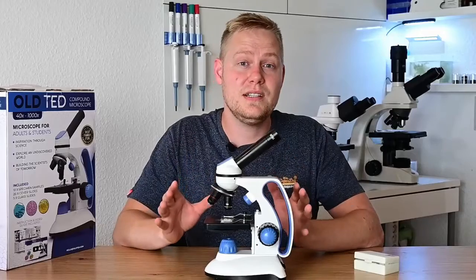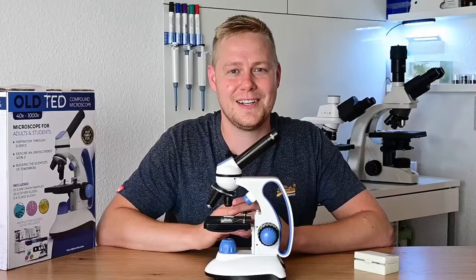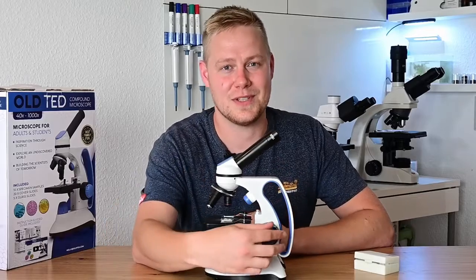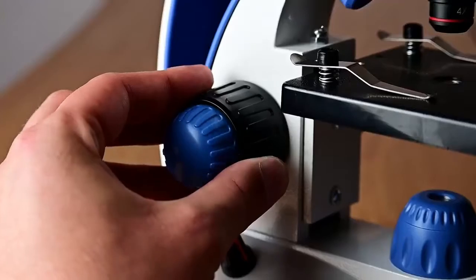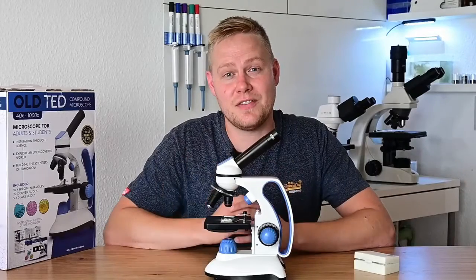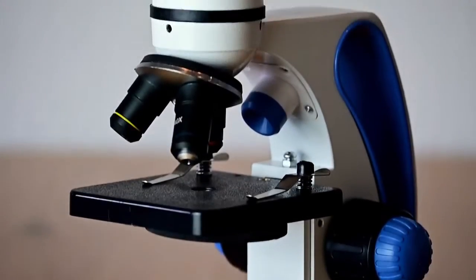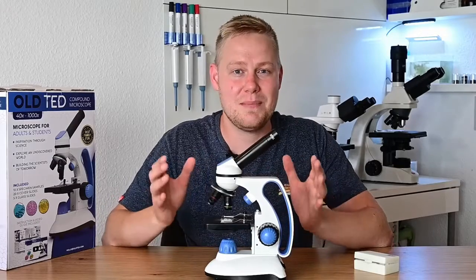To make focusing easier, make sure to always start with the 4x objective. Use the coarse and the fine focus knobs on the side to adjust your focus. To increase the magnification, simply turn the nose piece to the next objective. Now you're ready to explore the amazing microworld.